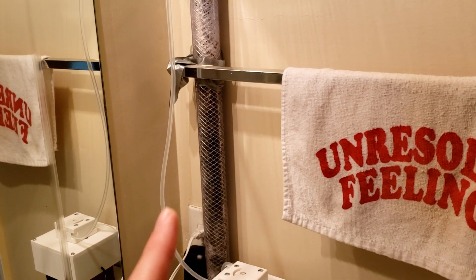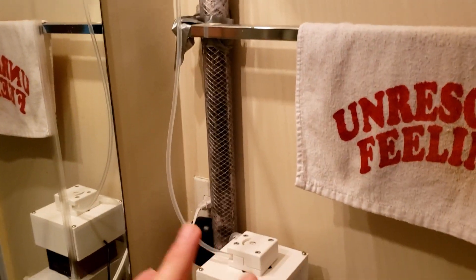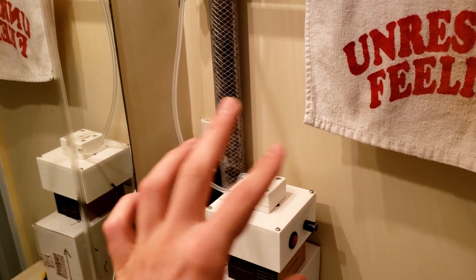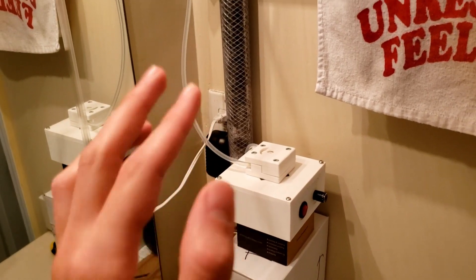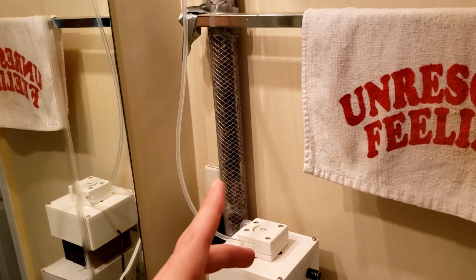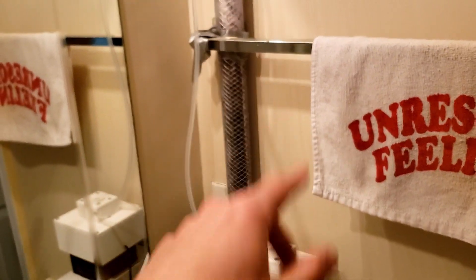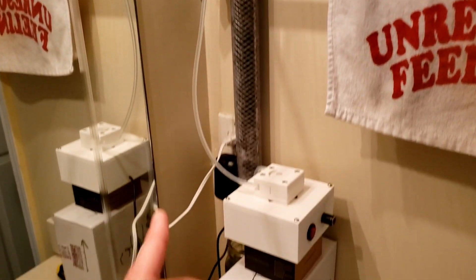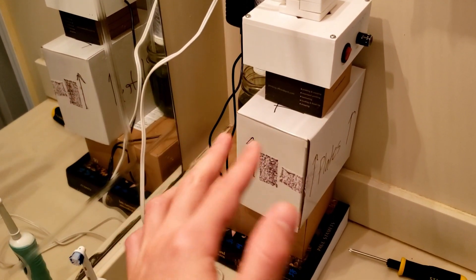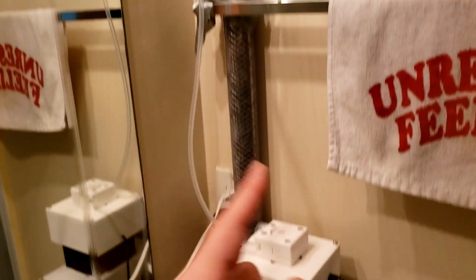The other idea I was thinking of is isolating Trametes versicolor, or turkey tail fungus, because turkey tail grows really, really fast. If you walk through the woods in the U.S. — probably around the world — you'll find turkey tail everywhere; it's ubiquitous. It probably colonizes pretty quickly, has low risk of contamination, and probably breaks down a wide variety of substrates. It would be really fun to grow through here and see if it can break down potentially toxic compounds.